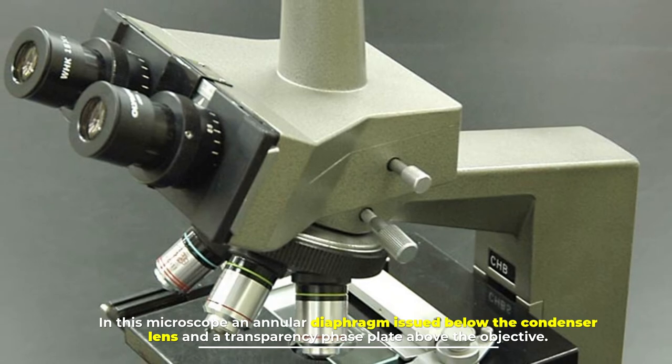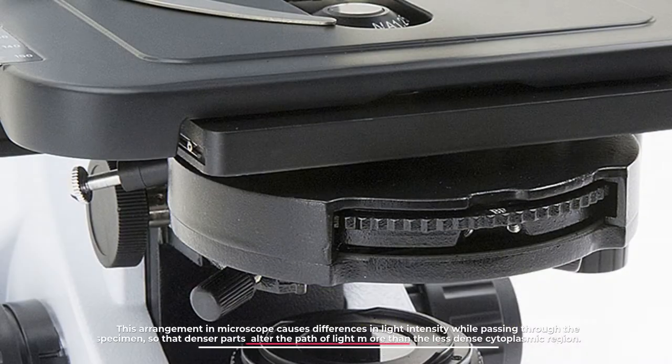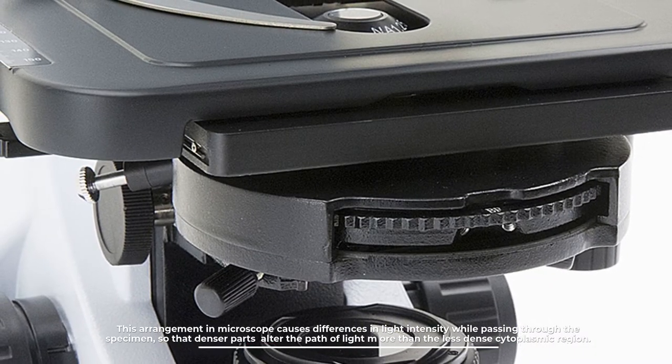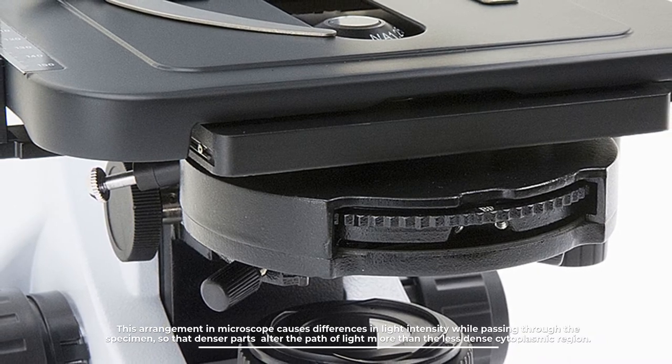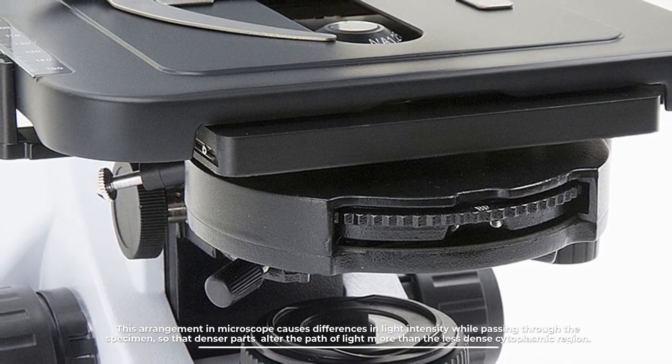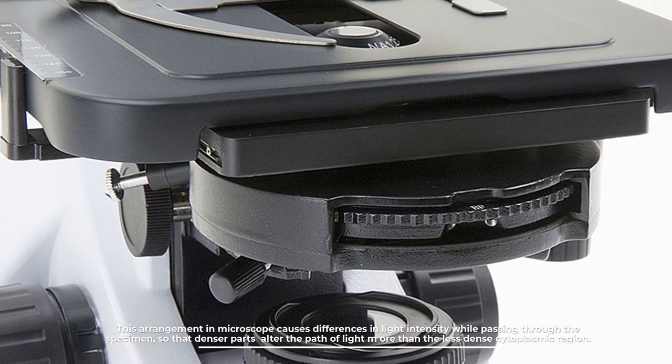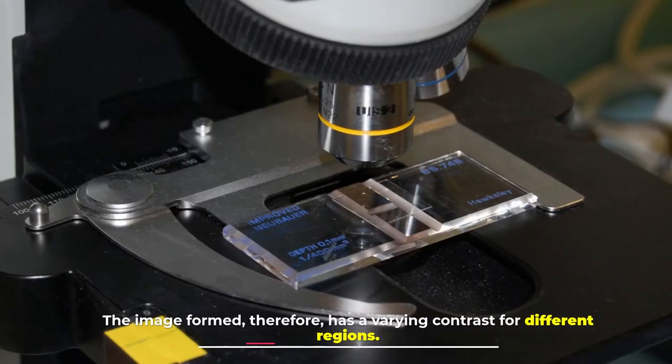This arrangement in microscope causes differences in light intensity while passing through the specimen so that denser parts alter the path of light more than the less dense cytoplasmic region. The image formed therefore has a varying contrast for different regions.